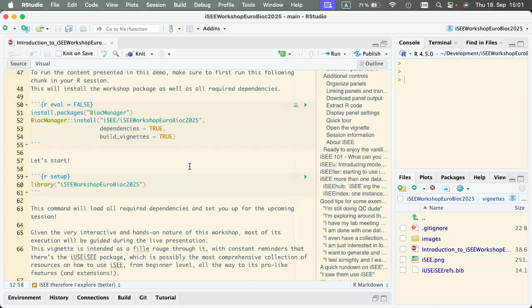Maybe instead of the heat maps or on top of that, we can have the bubble plots where you have the information of a heat map, and then on top you have information encoded by the size or the radius that can tell you the percentage or the amount, and then you have the color encoded with the hue of that. But otherwise, we have all of that, right? So, okay, maybe dendrograms, depending on what you fancy.